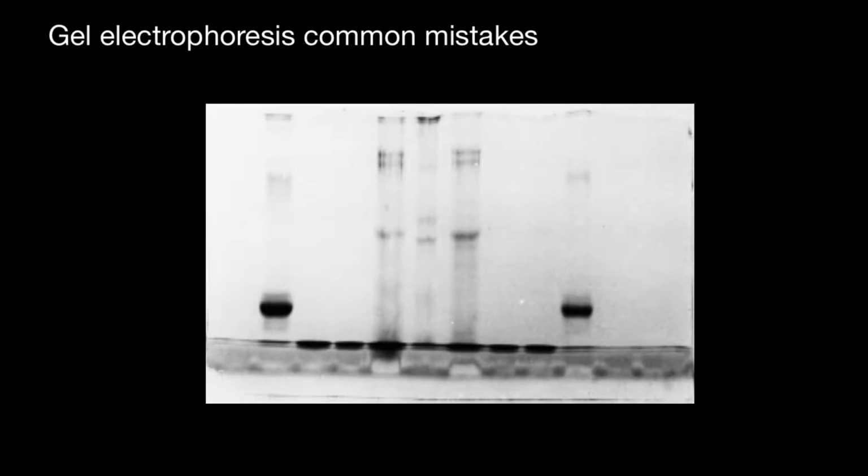As long as the proteins were precipitated in the gel by the acidified alcohol in the stain solution, the problem could be corrected simply by restaining with fresh dye. Sometimes we also can lose whole lanes if we underload wells, so this can be another issue.